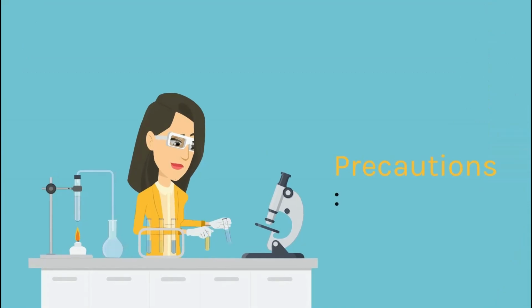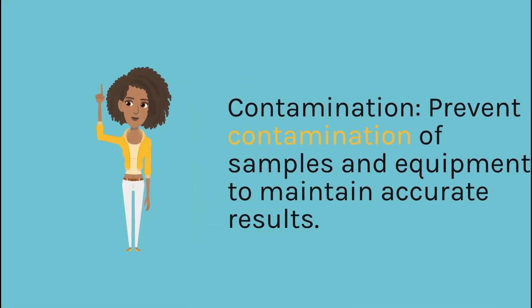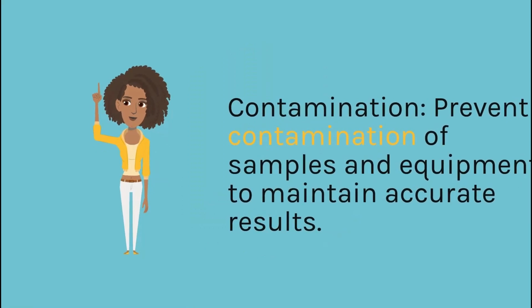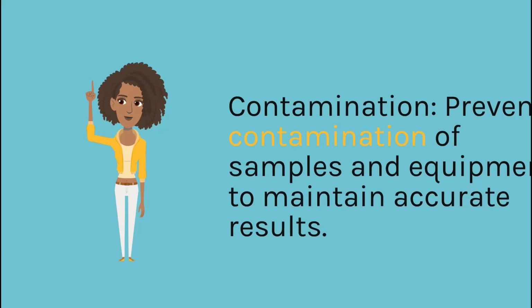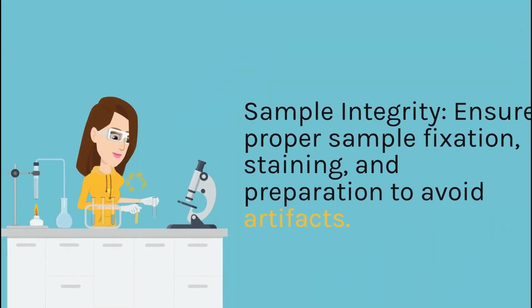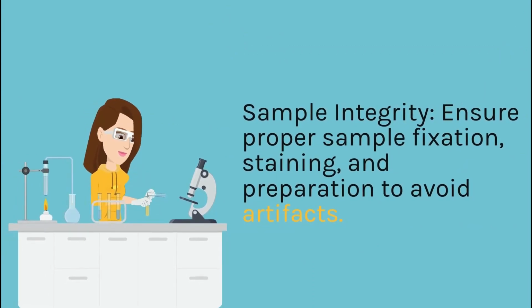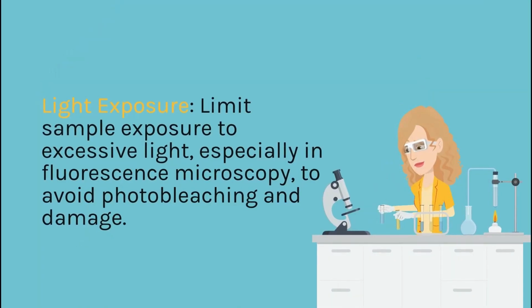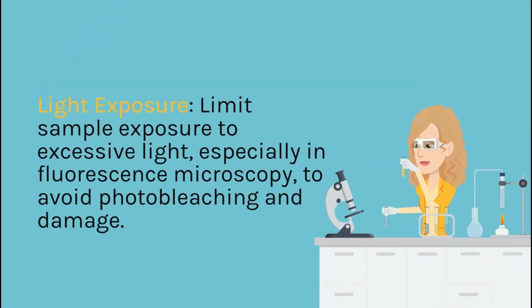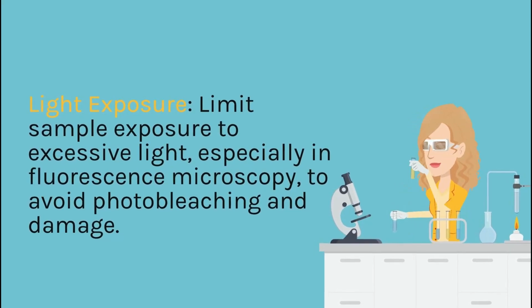Precautions. Contamination, prevent contamination of samples and equipment to maintain accurate results. Sample integrity, ensure proper sample fixation, staining, and preparation to avoid artifacts. Light exposure, limit sample exposure to excessive light, especially in fluorescence microscopy, to avoid photobleaching and damage.